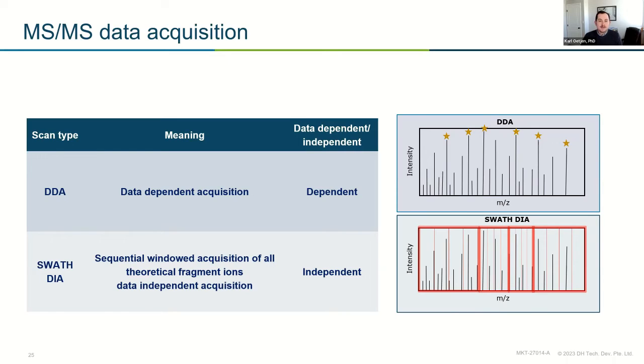If you're a SCIEX user, data-dependent acquisition we sometimes refer to as IDA, or information-dependent acquisition, and this can get kind of confusing, admittedly so, especially as you communicate with colleagues that are using different vendors' instruments, about what is actually occurring here. So what I would suggest is that you figure out what bucket the experiment you are doing falls into, and that usually helps.